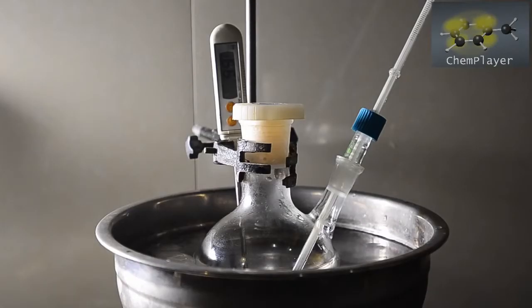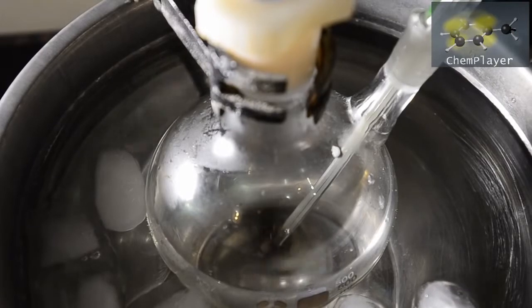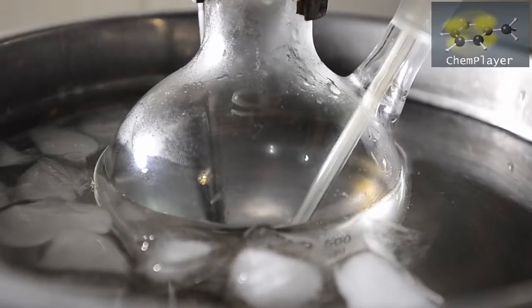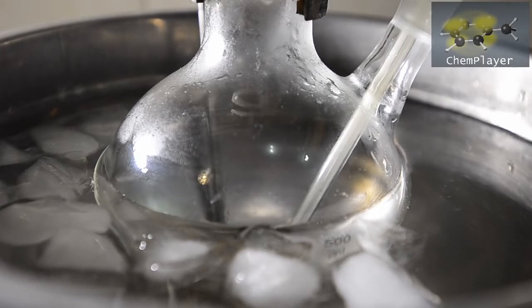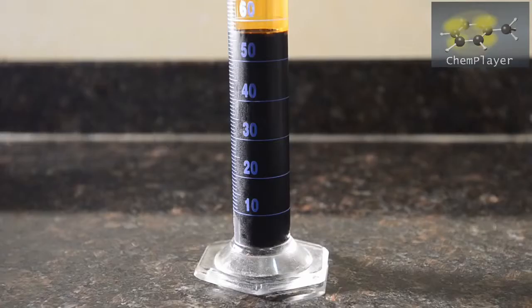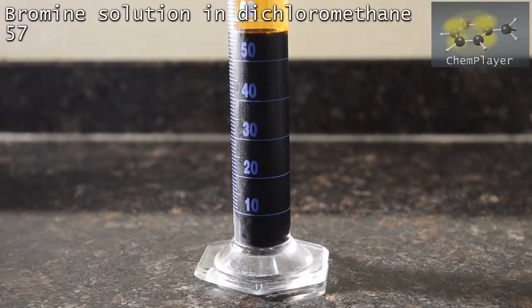Here's our first setup. We're using the 500 ml flask, which has a thermometer in it so we can record the temperature. We've also got a magnetic stirrer in the flask, and the apparatus is sitting in an ice bath. We don't know if this is going to be exothermic or not, so we want to be careful just in case. Here's our bromine solution in dichloromethane.